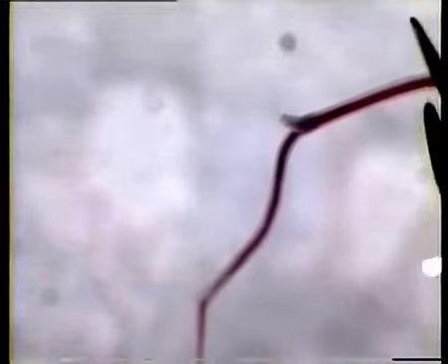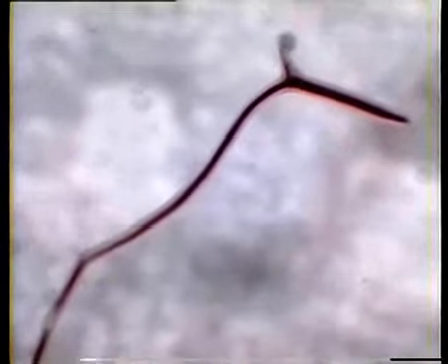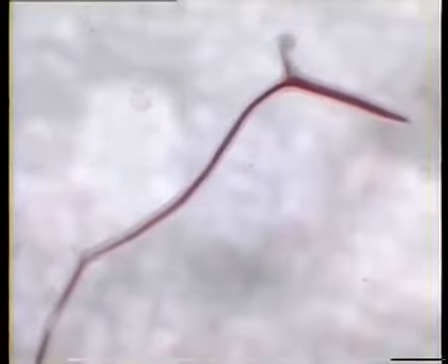Here you can see how the artery is cut as perpendicular as possible to make it easier to mount onto the wire. The small side branch is then grabbed and the whole vessel is transferred to the prepared myograph chamber.